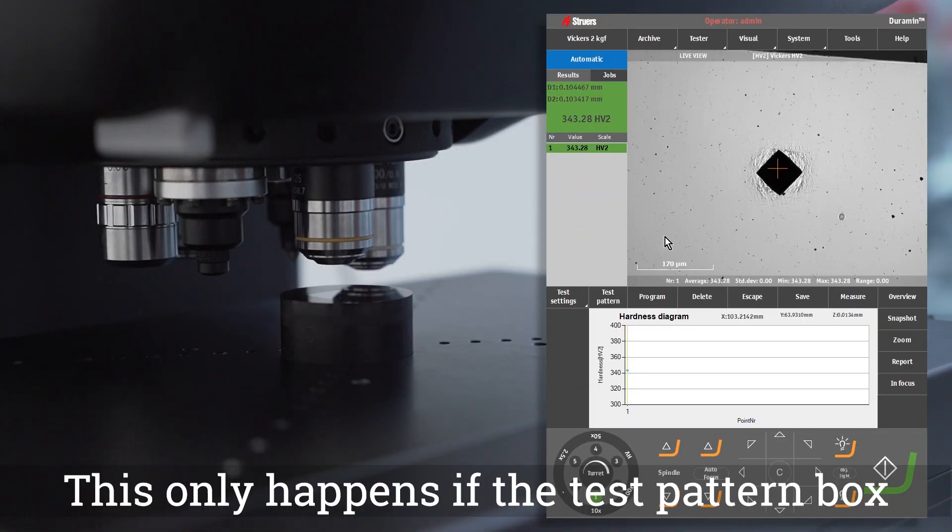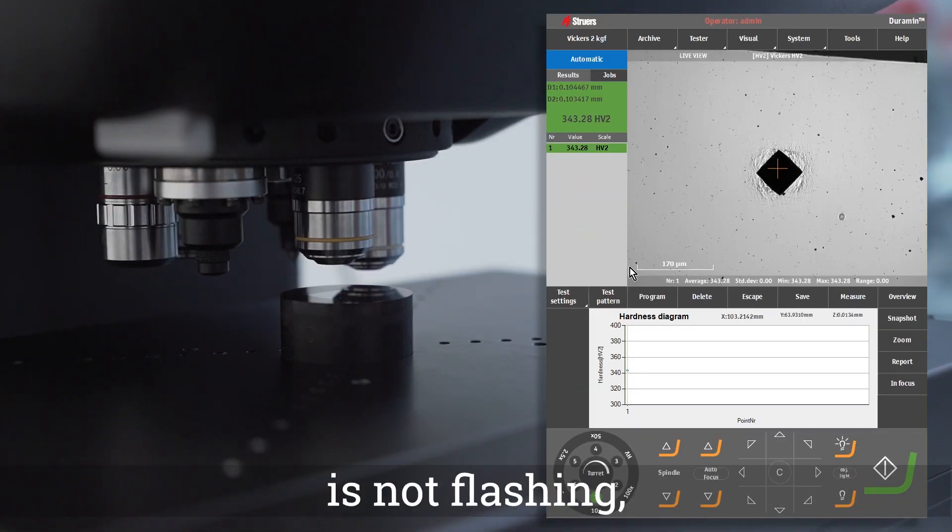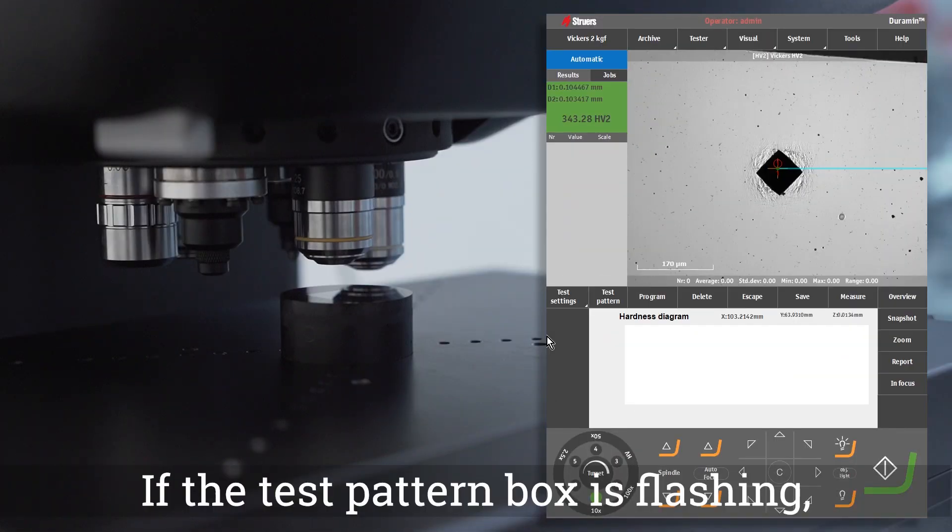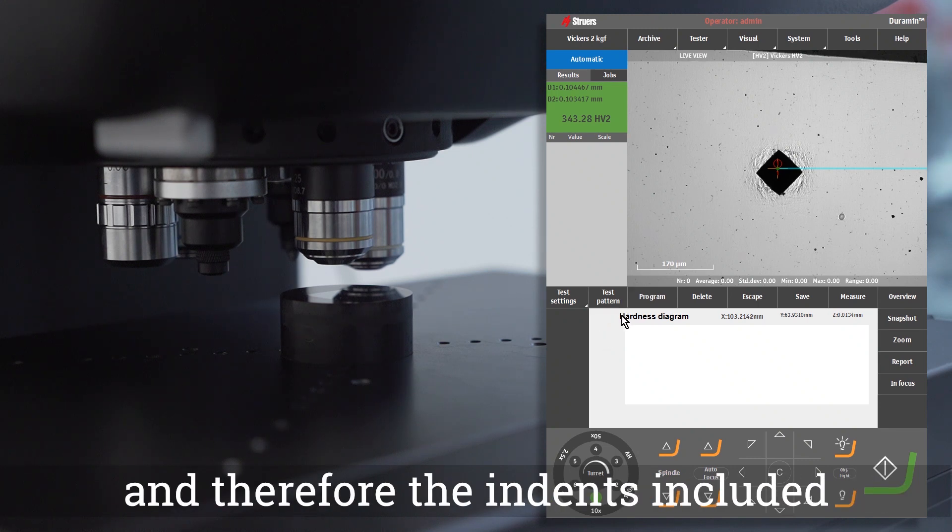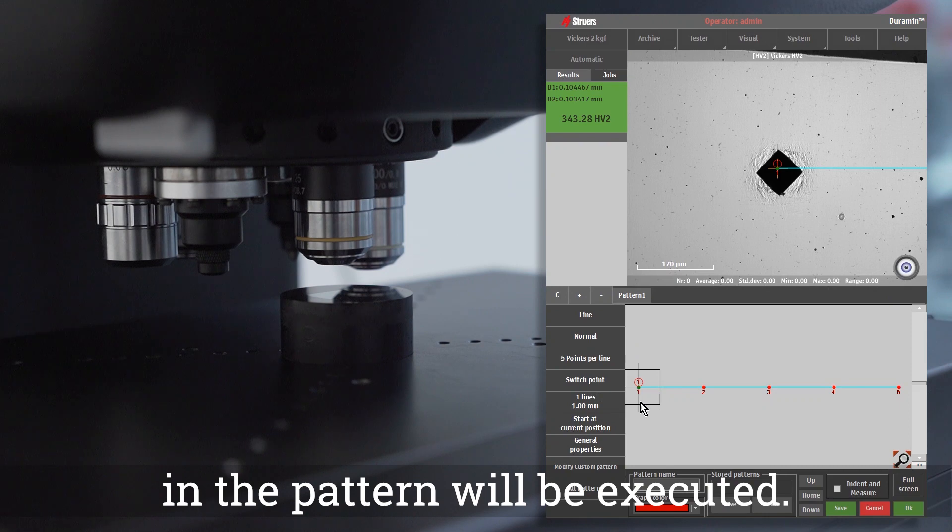This only happens if the test pattern box is not flashing, which means that there aren't any active patterns. If the test pattern box is flashing, it means that an active pattern is available and therefore the indents included in the pattern will be executed.